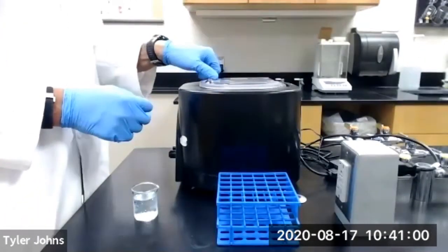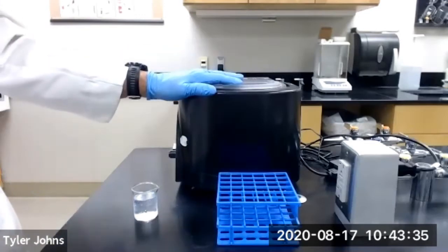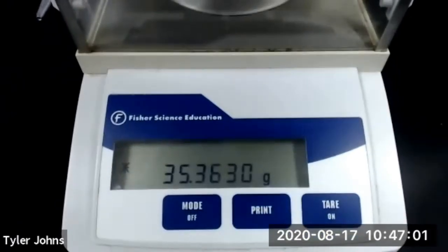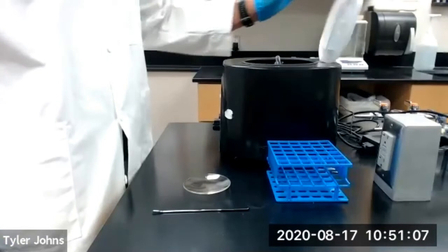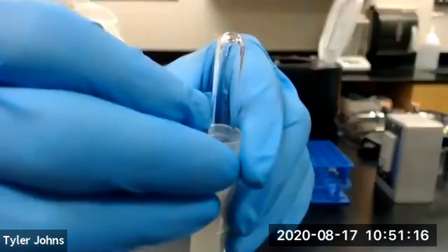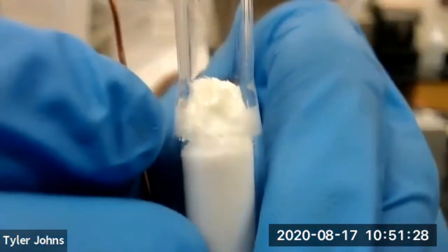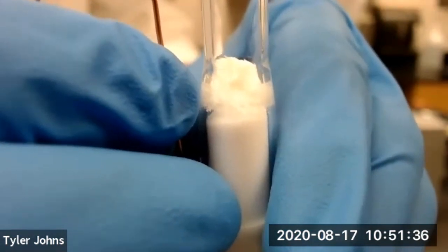Centrifuge the Craig tube assembly to separate the crystals from the mother liquor. While centrifuging, pre-weigh a watch glass — the mass of our watch glass is 35.3630 grams. Once the centrifuge is stopped, remove the Craig tube assembly and use the copper wire to lift it from the centrifuge tube. You can see that the crystals are sitting on top of the Craig tube plunger. Transfer the crystals to the pre-weighed watch glass.